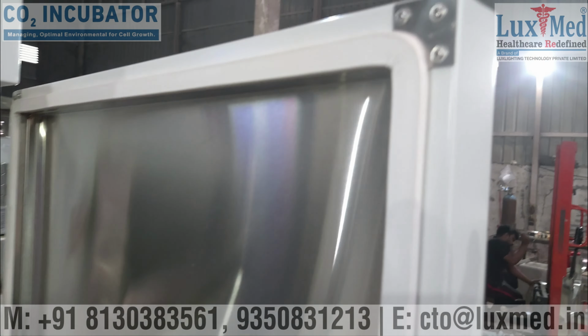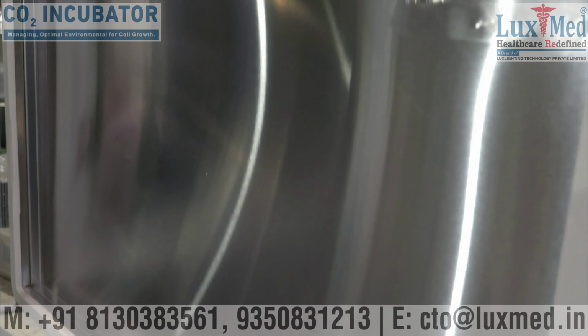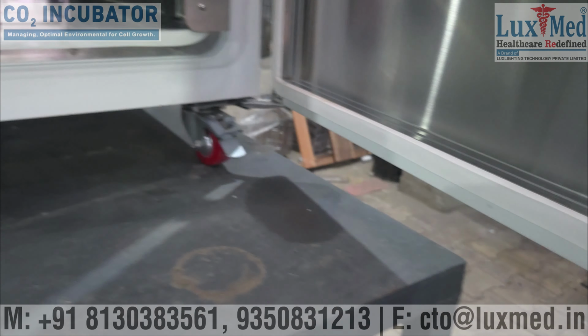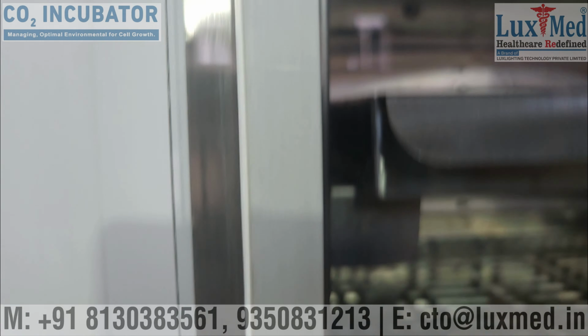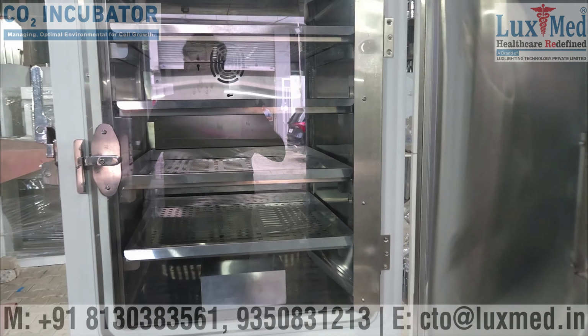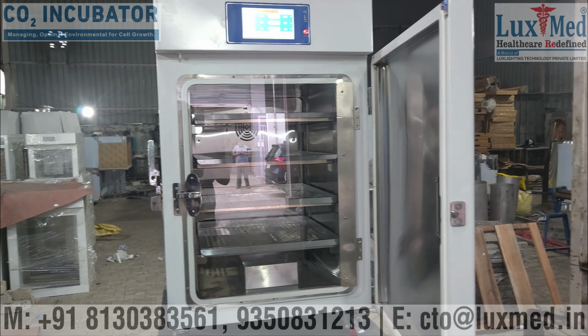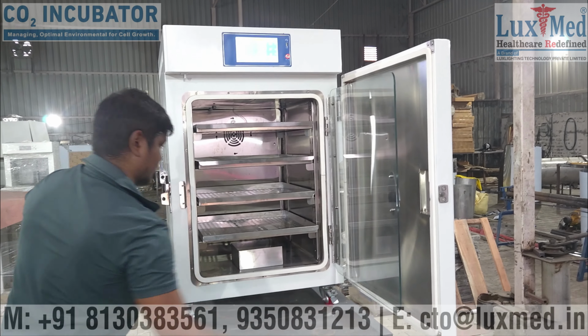Vaccine and antibody production. They play a role in the production of cell-based products like vaccines and antibodies, which are crucial in the pharmaceutical industry. Diagnostics. CO2 incubators are used for diagnostics, such as cell-based assays and monitoring cell growth in various applications.